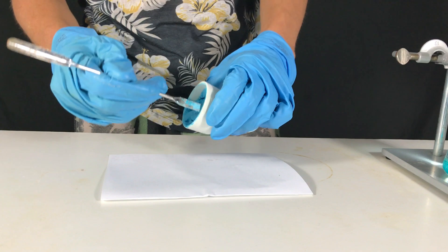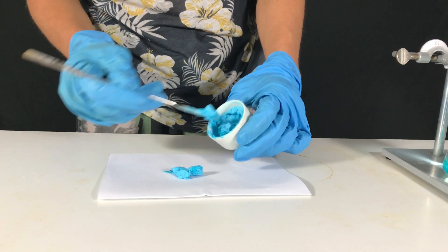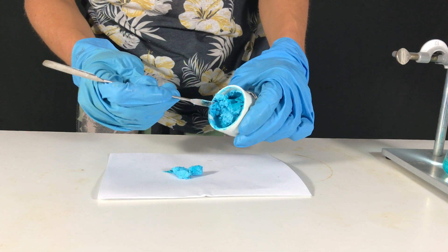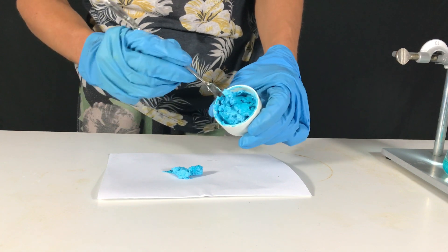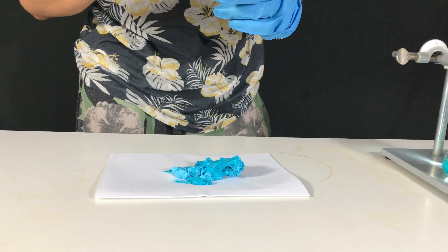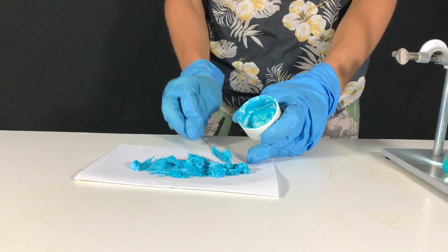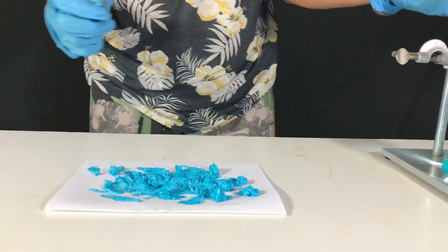For drying, the copper benzoate still containing some isopropanol was again transferred to a piece of paper. It was spread out to maximize the surface area.